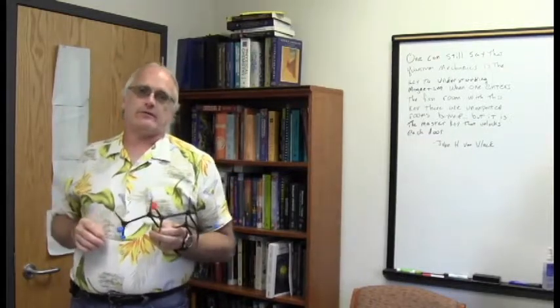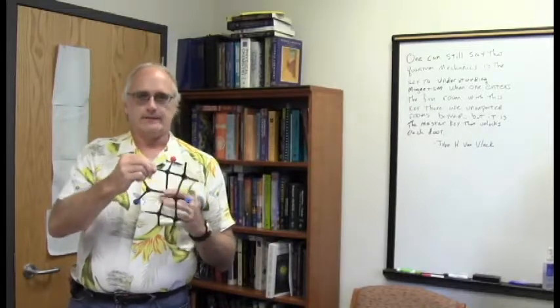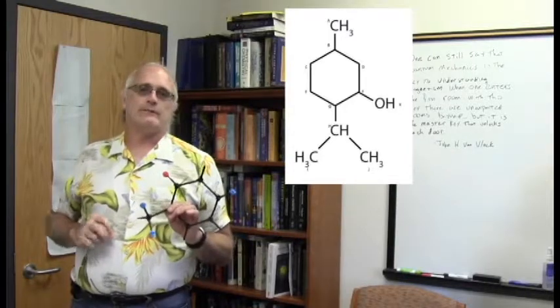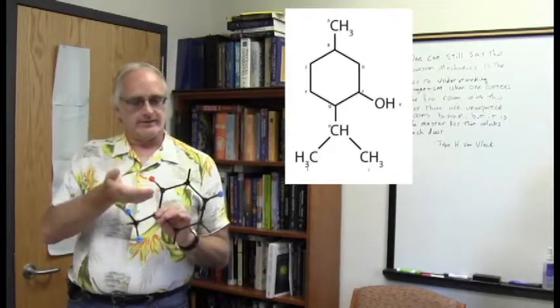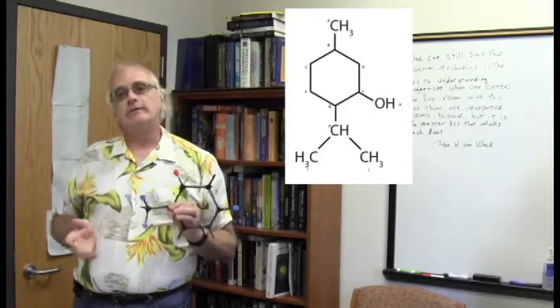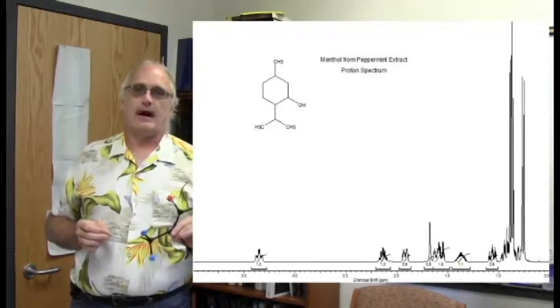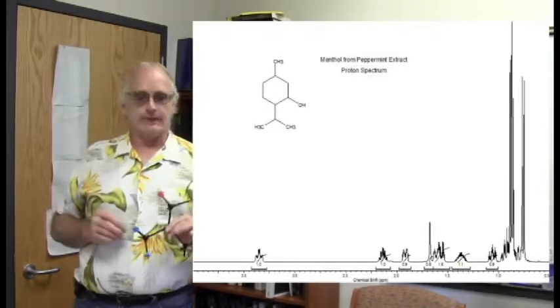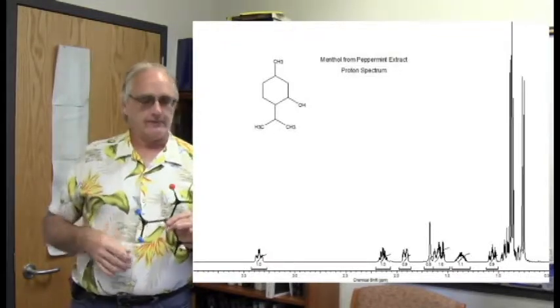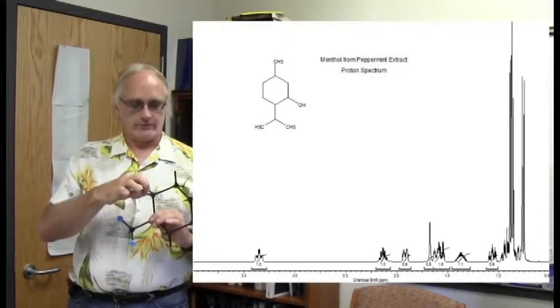And among the positions here that I think are fairly obvious is this one right here. This is, on my labeling scheme, proton F. This will be the most downfield one because it is the hydrogen on a carbon closest to the oxygen. And sure enough, we do have one right down there, 3.4 to 3.5, kind of on the upfield range of what we would expect here, but within reason. And so I am pretty confident that I can see proton F.